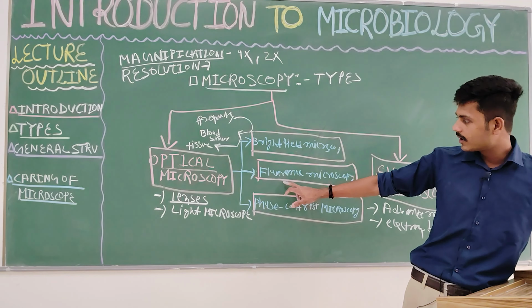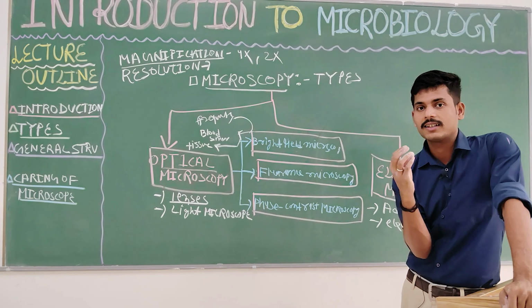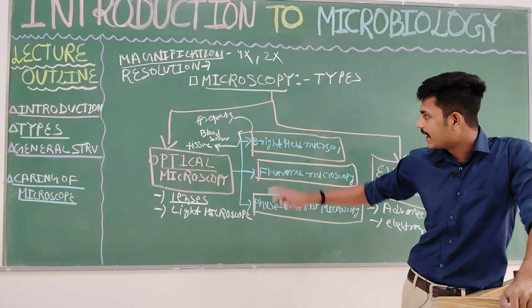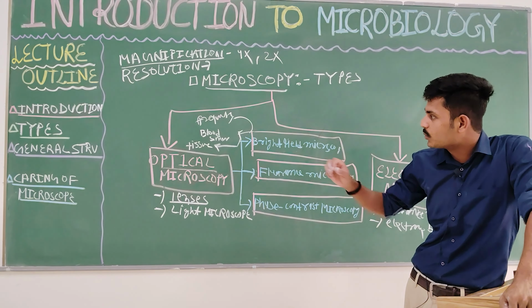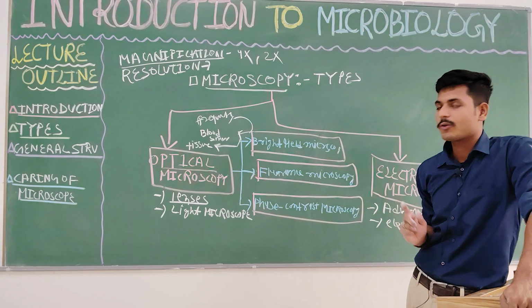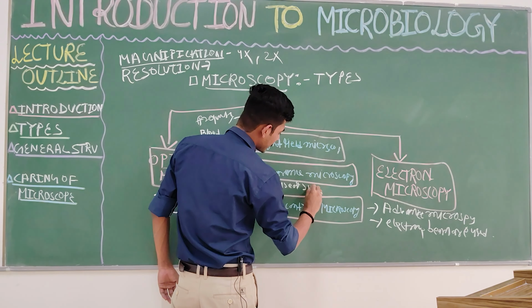This microscope has the capacity to generate a kind of light, the fluorescence, by which a transparent object will show color. In the bright field microscope, you have to stain the microbes, using different types of stains and chemicals to color the microbes in order to see them. But in the case of fluorescence, there is no use of staining.